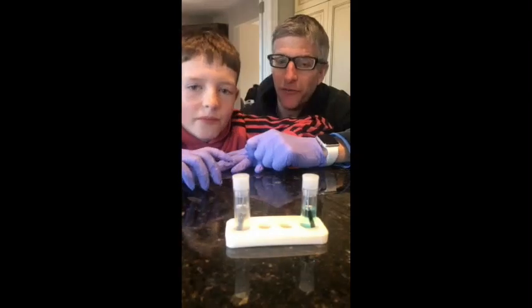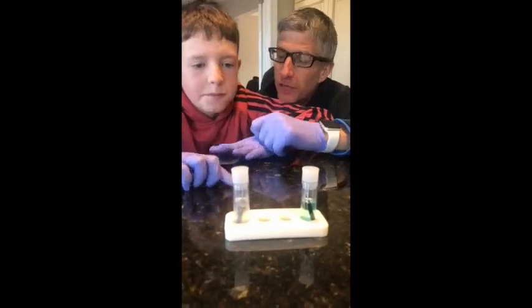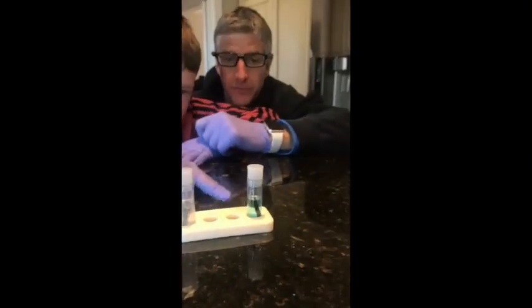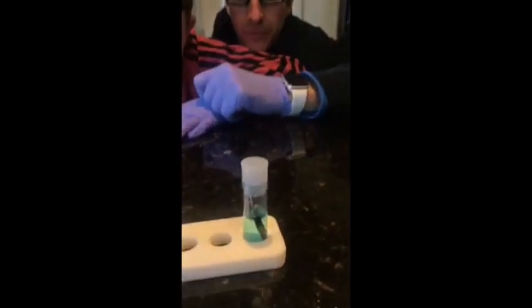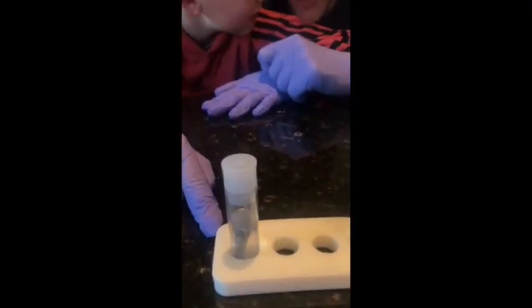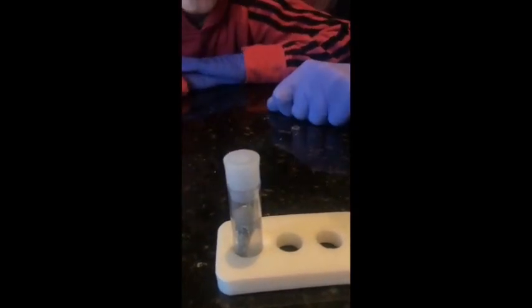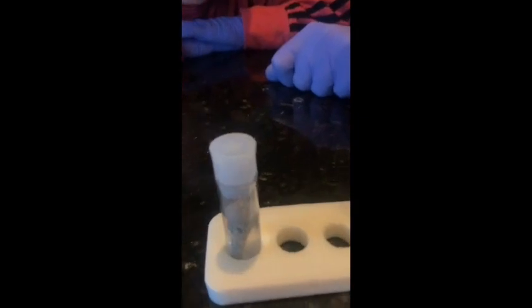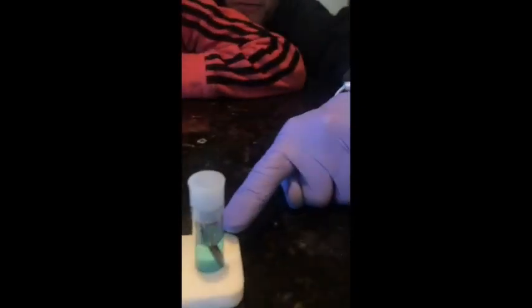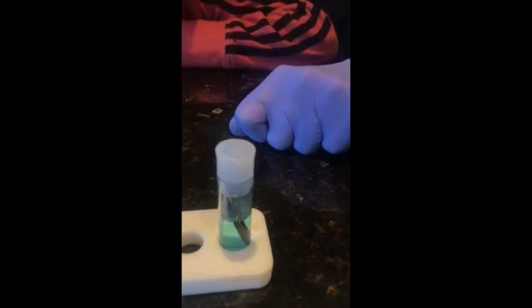And we're back again. 5 minutes to go. So 10 minutes in. Well, we're going to make some more observations. What do you think, Duncan? That one has bubbles, and that one sort of has tiny little needles. Yeah, shards, I was going to call them. What's the color of the solution there? Gray. Cloudy or not clear, right? Opaque, I think we call it. This one's bubbling up here. If the camera person can, thank you, camera person, get some bubbles going on there. Still black in color as well. Okay, see you guys in another 5.